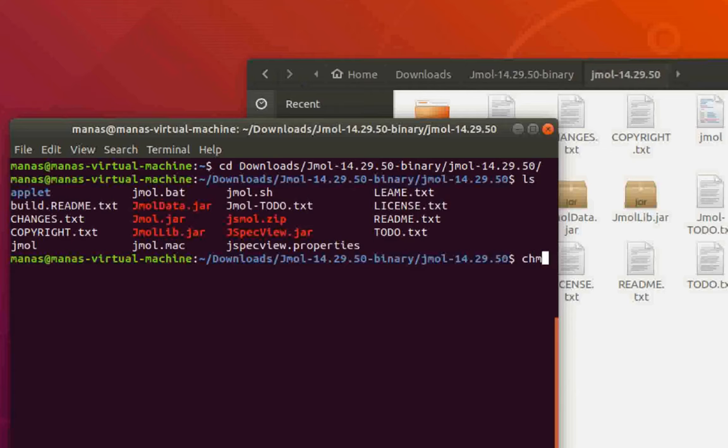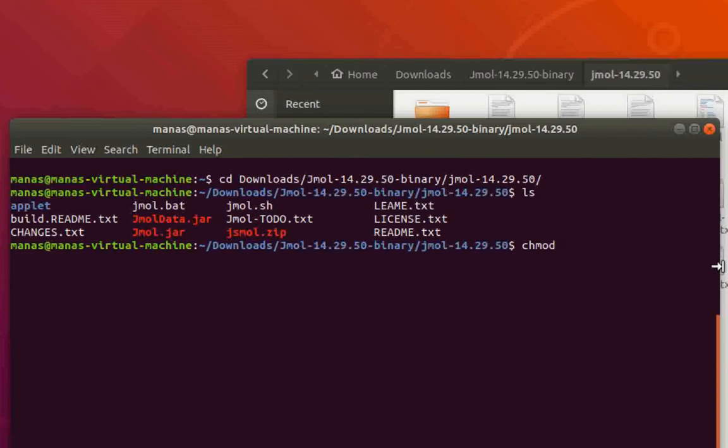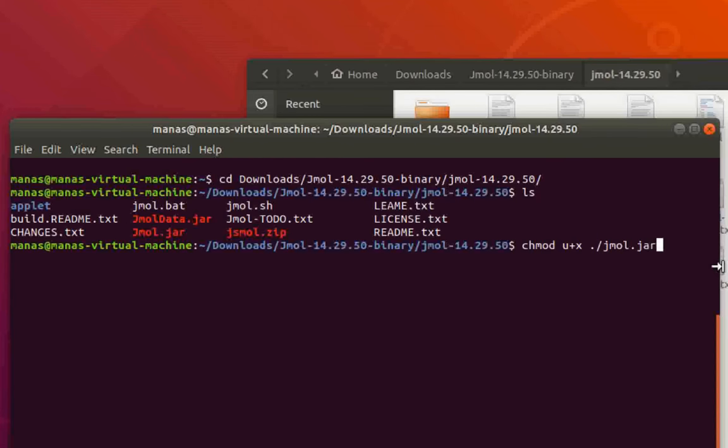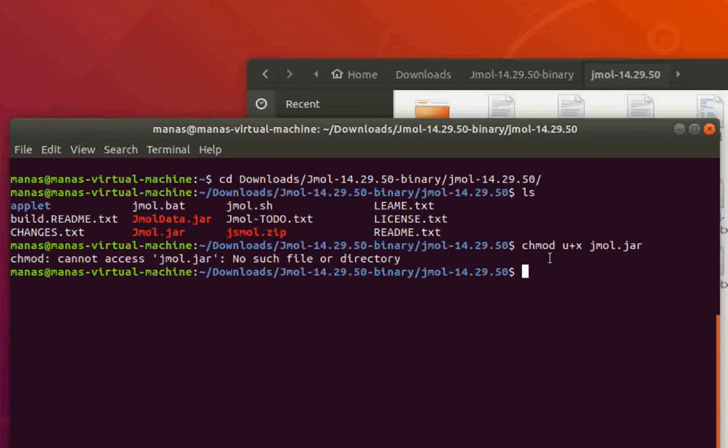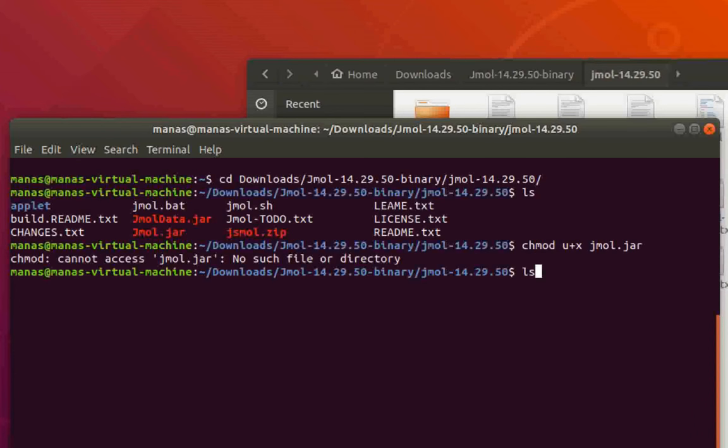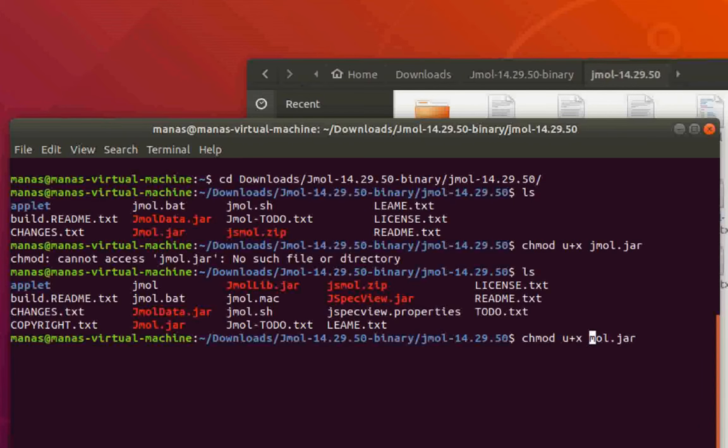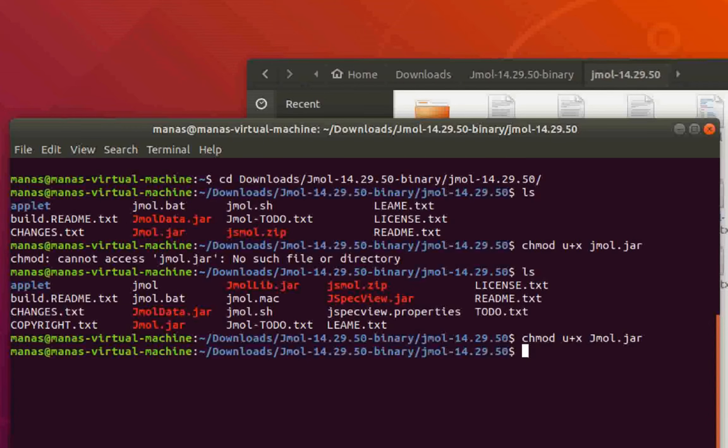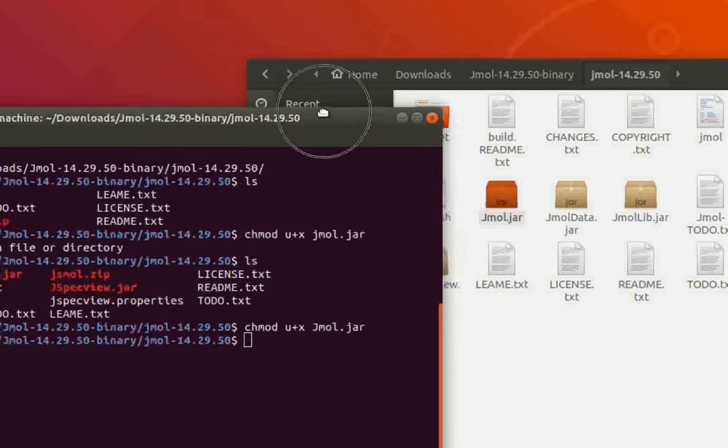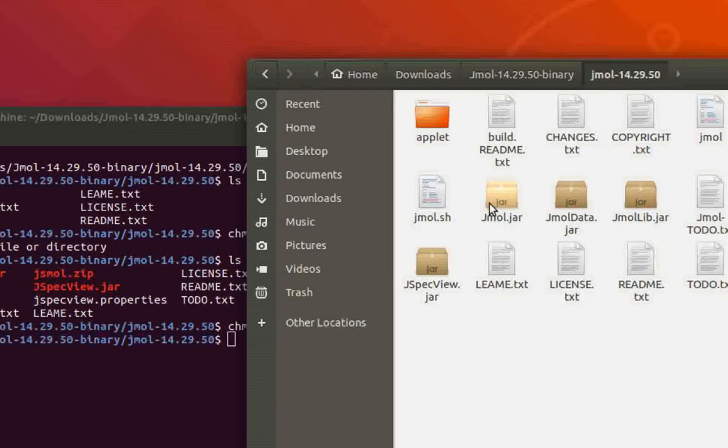We're going to convert the jmol.jar file into an executable. To do that, we'll give the command: chmod u+x jmol.jar. It says it cannot access the jmol.jar file - I entered the name wrong, this is actually an uppercase J. Now if you hit enter, your jmol.jar file is now an executable.